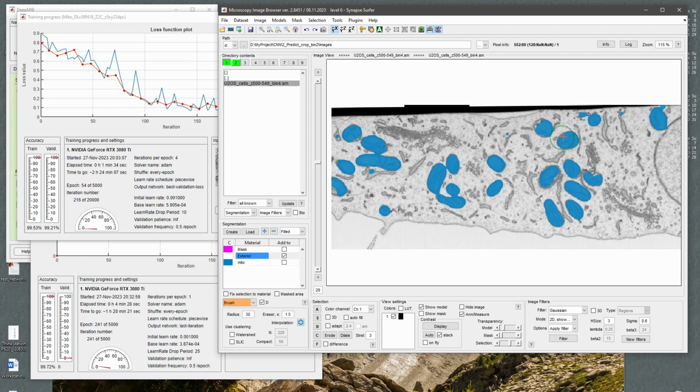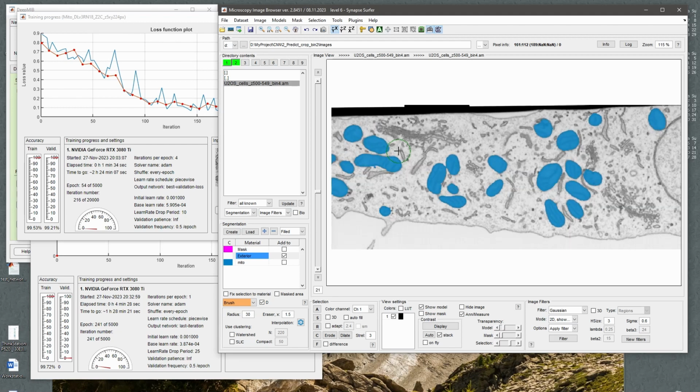So this is with the 2 images, so we have an artifact here, perhaps here, here, there, there. But then in the other one, you see the model is more smooth. There is something here. Yeah, one of these potential artifacts. But in general, the model looks way cleaner.